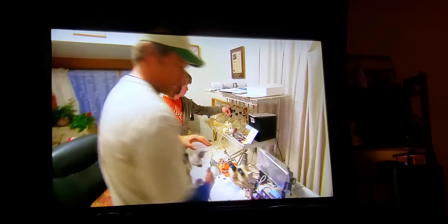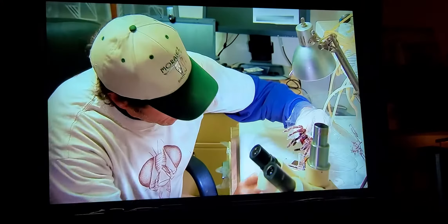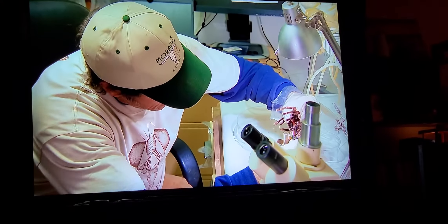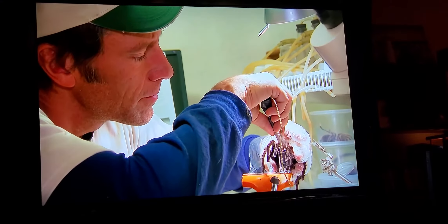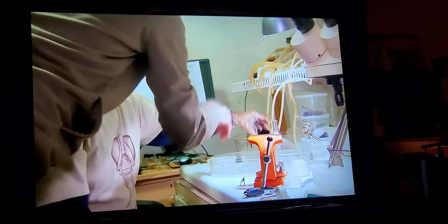This is the milking area, and I can show you how we take venom from the tarantulas. Be grateful to those fangs. A low blast of electricity is used to stimulate the spider into excreting venom through its fangs into shockingly small test tubes.